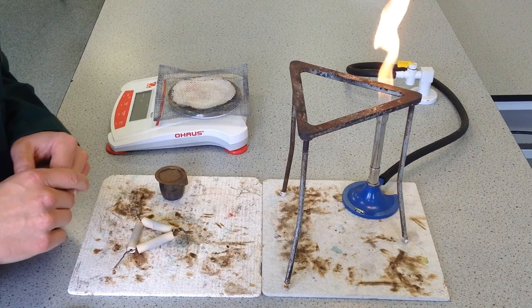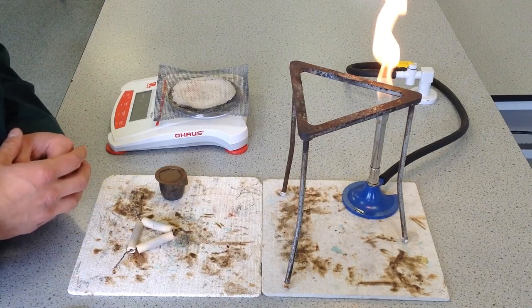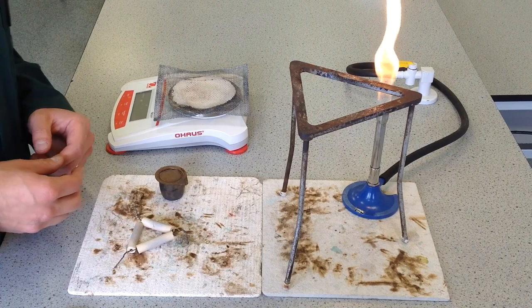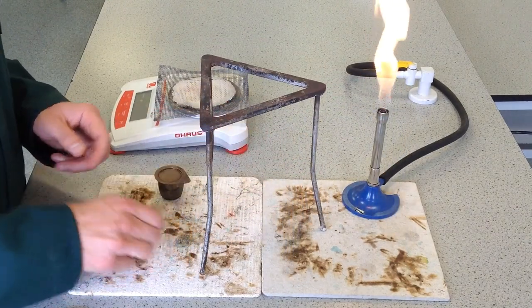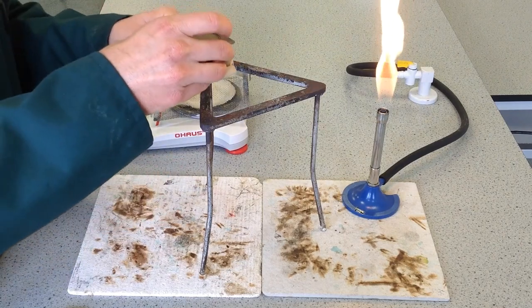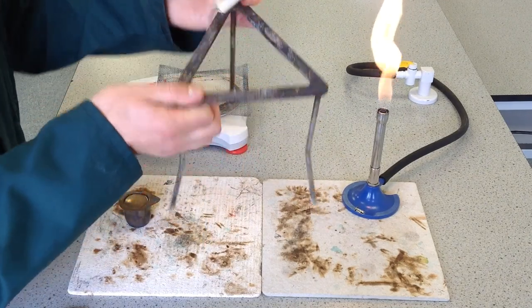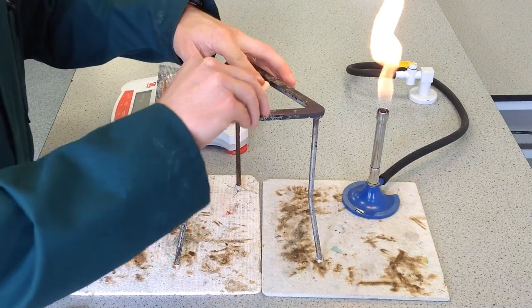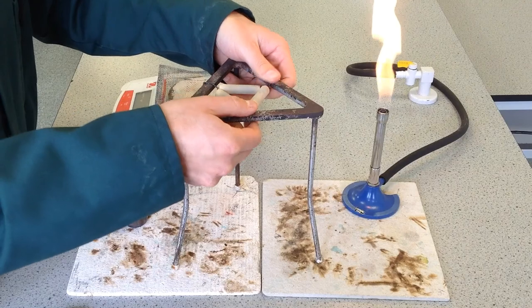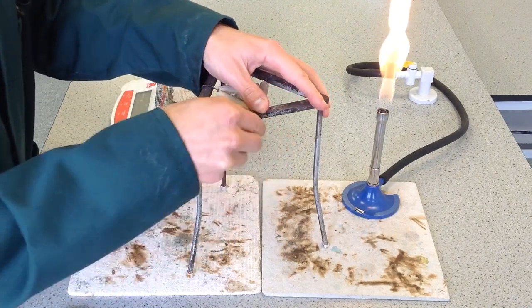Once you have filled your crucible with the substance you need to heat and weighed it, it's time to start heating. The first thing is to have a couple of heatproof mats down, then take a tripod and fit it with something called a pipe-clay triangle, which allows you to rest the crucible in the middle and heat the crucible directly. You orient the triangle of the tripod opposite to the triangle of the pipe-clay, rest it in, and twist the wires over so it's securely held in the tripod.